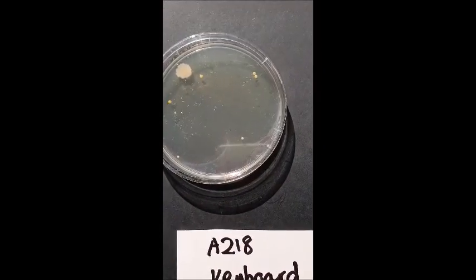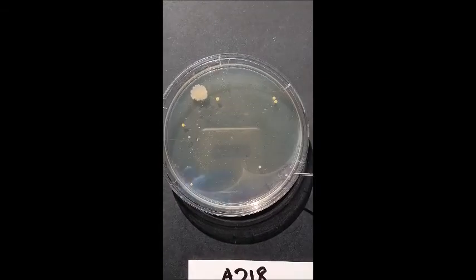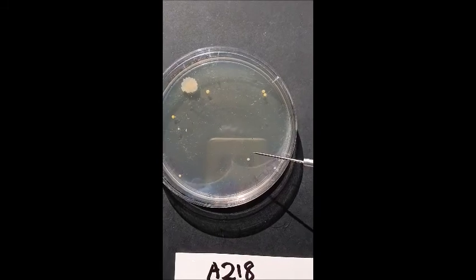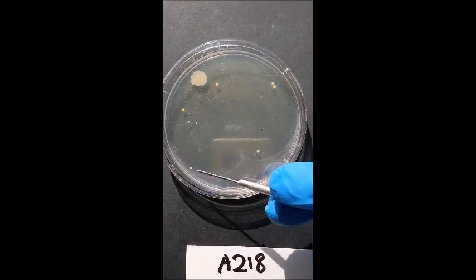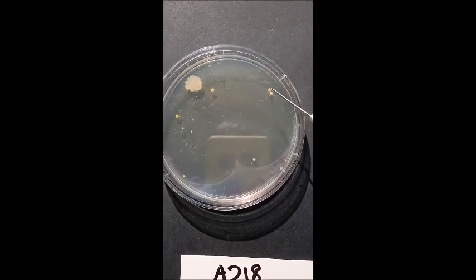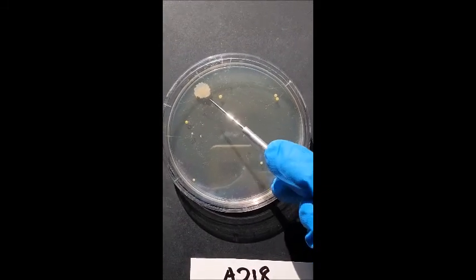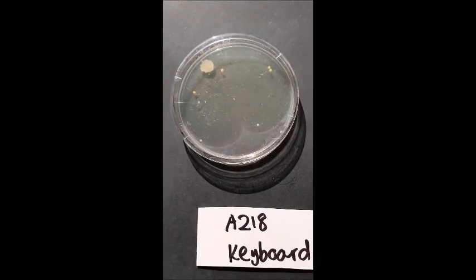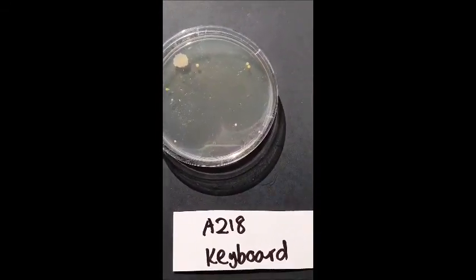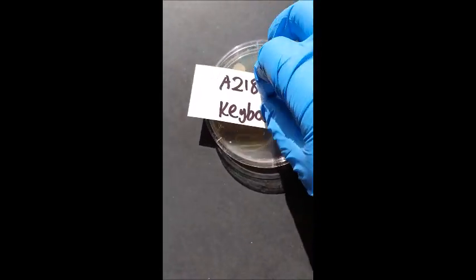So I'll just count them out. We've got the white ones. There's 1, oh, that's not a white one, that's a bit of plastic. 1, 2, 3 of the white ones. 1, 2, 3, 4 of the yellow ones. And one of these big ones that could be a mold or a fungus or a bacteria. I don't know off the top of my head.